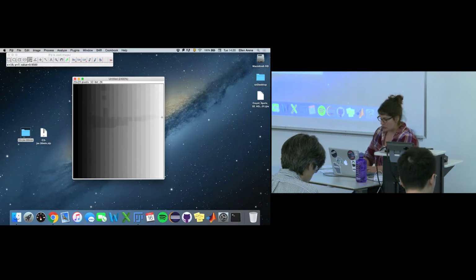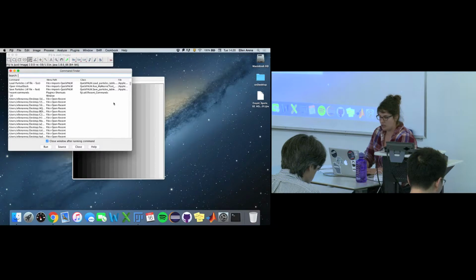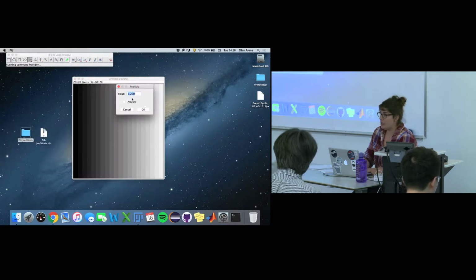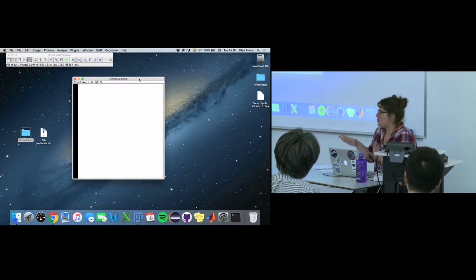But now what we're going to do is just do some math on these guys. These are really small pixel values, and we're going to multiply them by a really large number. In fact, we're going to multiply them by 100 million. So that's a 1 followed by 8 zeros. Okay? So if we multiply it by 100 million, something weird happened to the image, right?